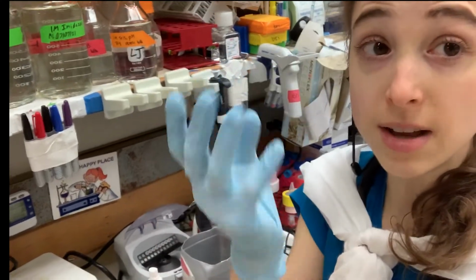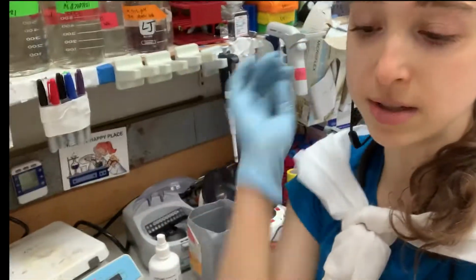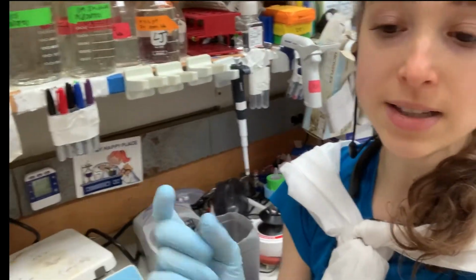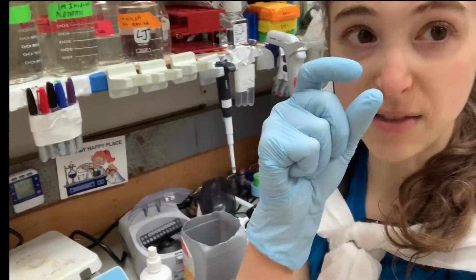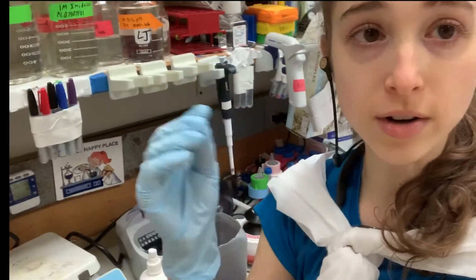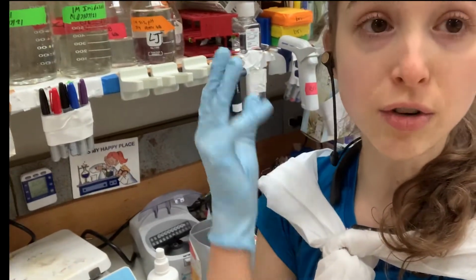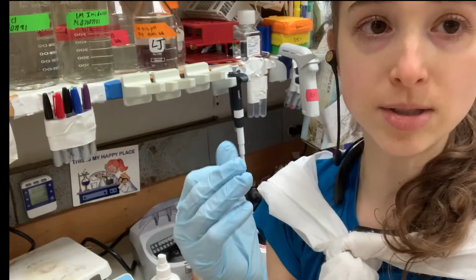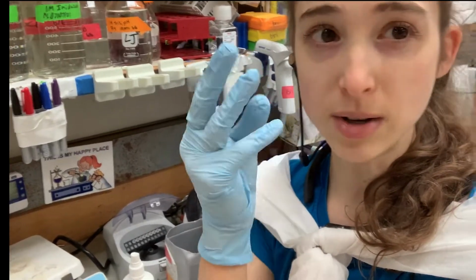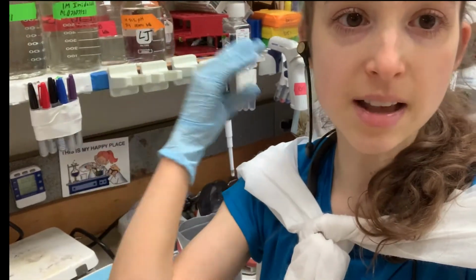But there are some things that you can't just keep out like your other stock solutions. Things like DTT, a reducing agent. We can make stock solutions of that at 1 molar and then freeze that, or we can add the powder fresh. And so we can make these solutions to order and then add those fresh components that are going to oxidize or degrade over time. Like we add the antibiotics to our media at the last minute because we don't want that to degrade before they can actually work. We add the reducing agents like the DTT, the BME and stuff.